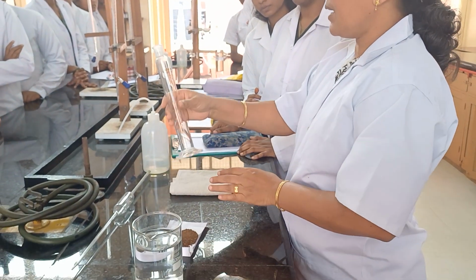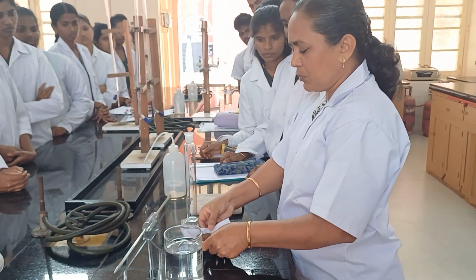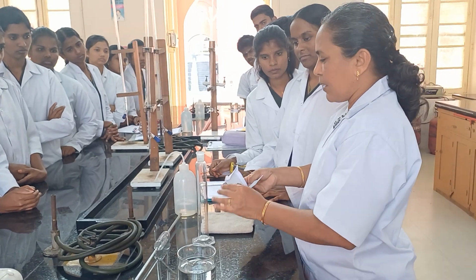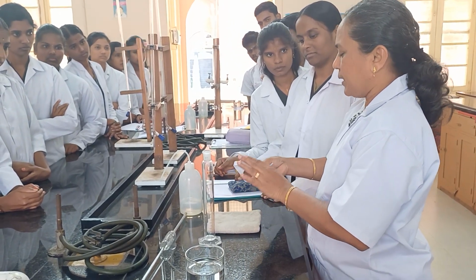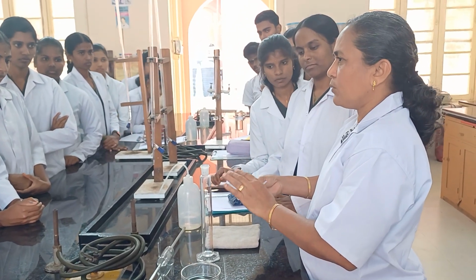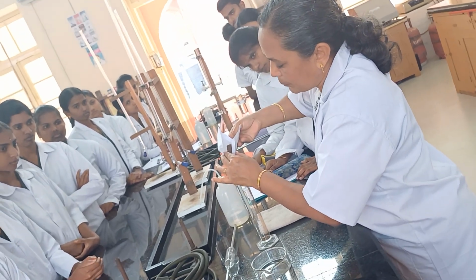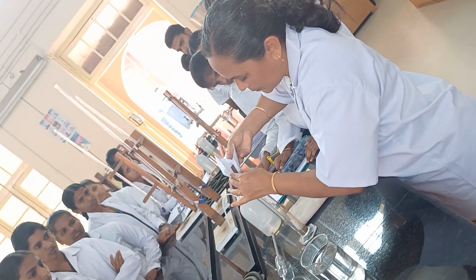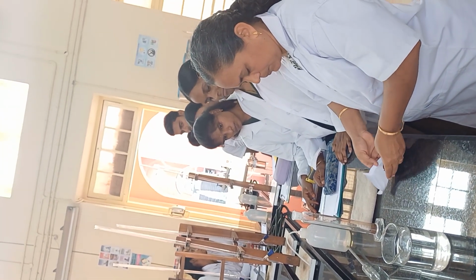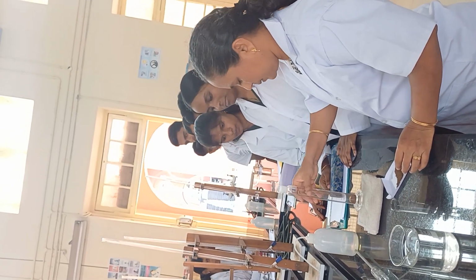For this we need a 100 ml measuring cylinder with stopper, and then we have to exactly weigh 20 gram of soil sample and transfer the sample in small quantities at a time. The entire soil should not be transferred at once. In small quantities we have to transfer the soil with gentle tapping, so that the soil is completely packed in the cylinder.